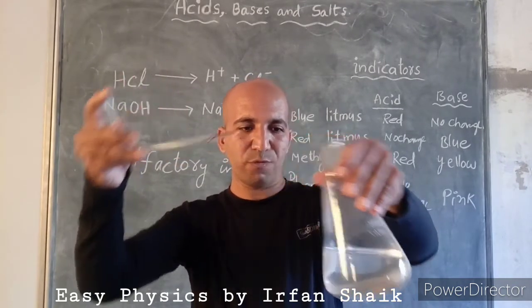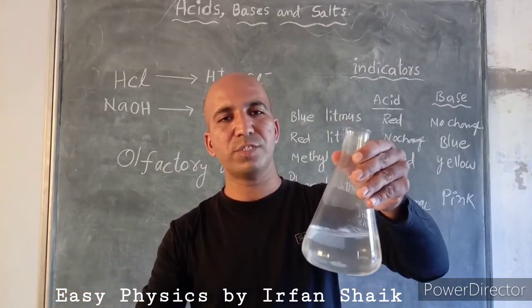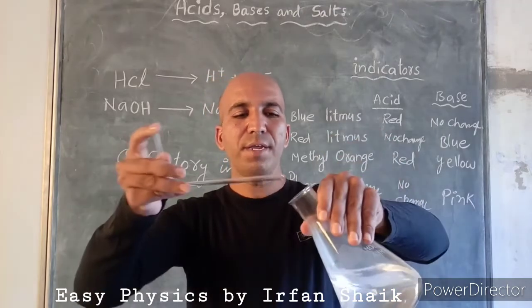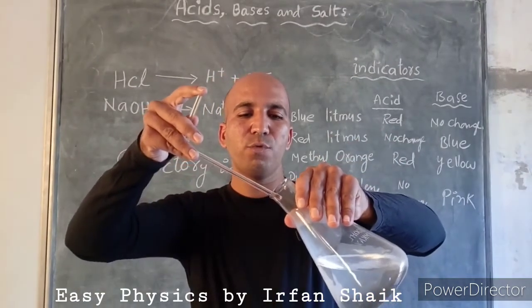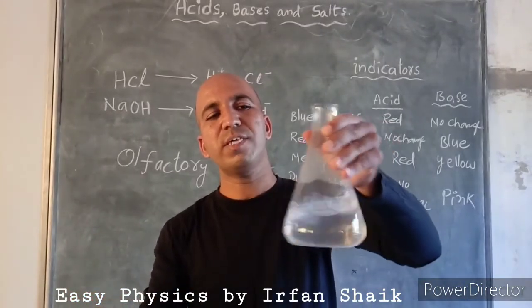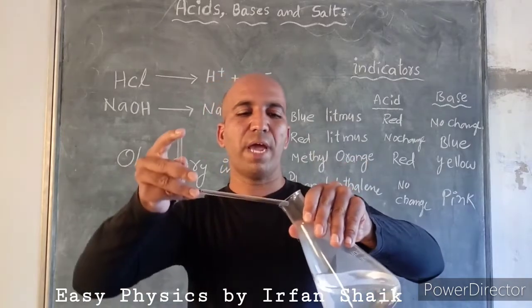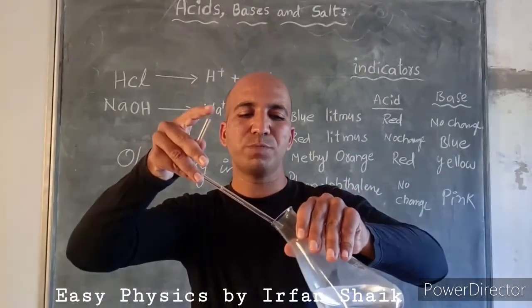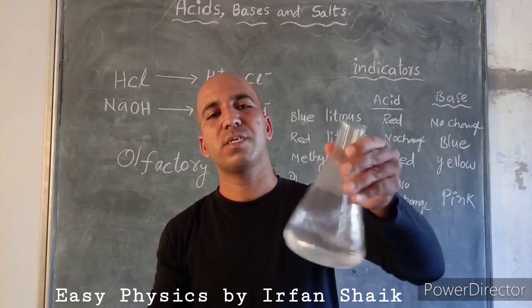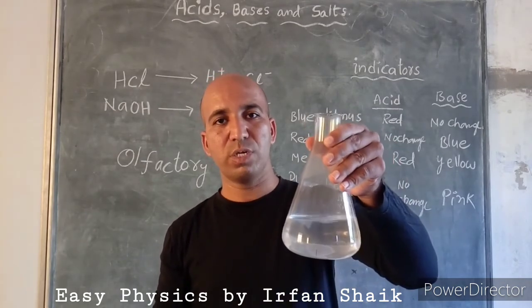Observe carefully — I am releasing only drops of acid. After releasing some drops of acid, we have to shake the flask thoroughly. Then again add a few drops of acid, shake the flask again. By adding drops of acid and shaking the flask thoroughly, this is how we dilute an acid.